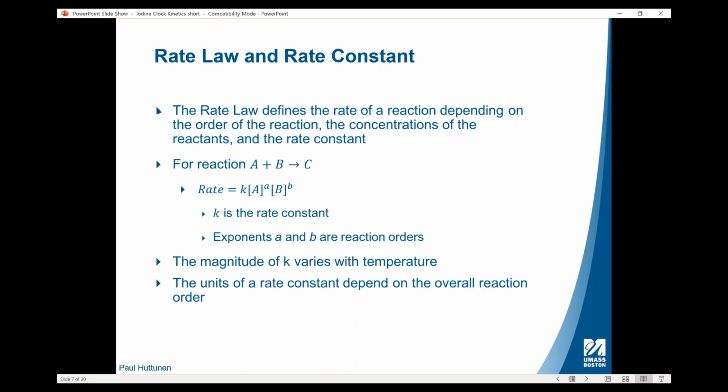And the units of the rate constant are dependent on the overall reaction order. So you will see in the makeup data that there is an error with the rate constant units, but we will discuss that later.